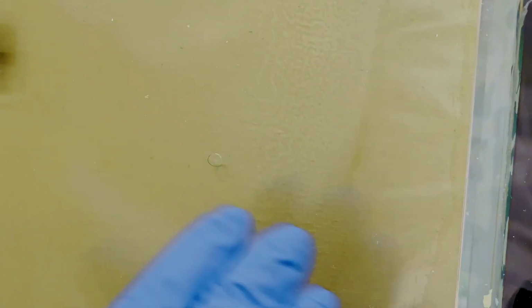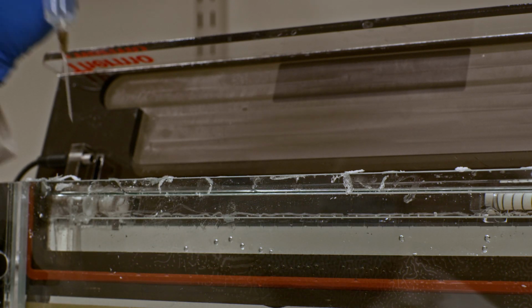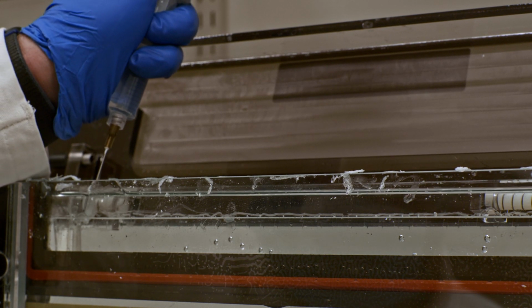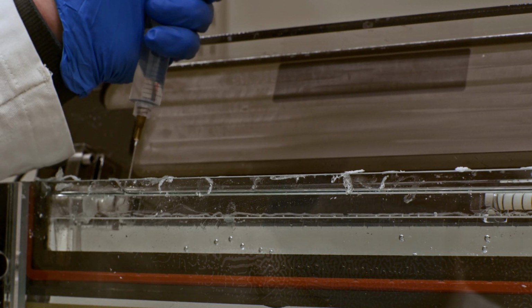So I will skip over that well because, since the comb did have enough room for 36 wells, I don't have to use all 36 because I only have 32 samples. That's one way you can get away with it. Of course, it may not look as nice if you have to skip a sample in between, but you can always fix your image after you run your phosphor imaging on some sort of image fixing software.